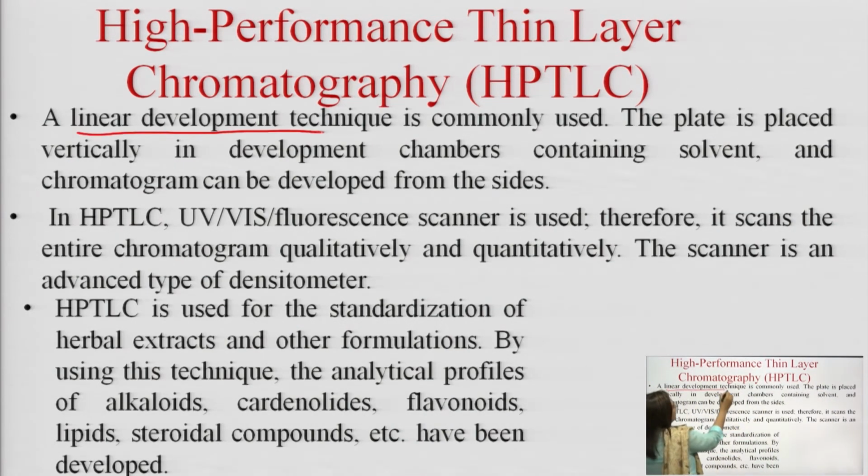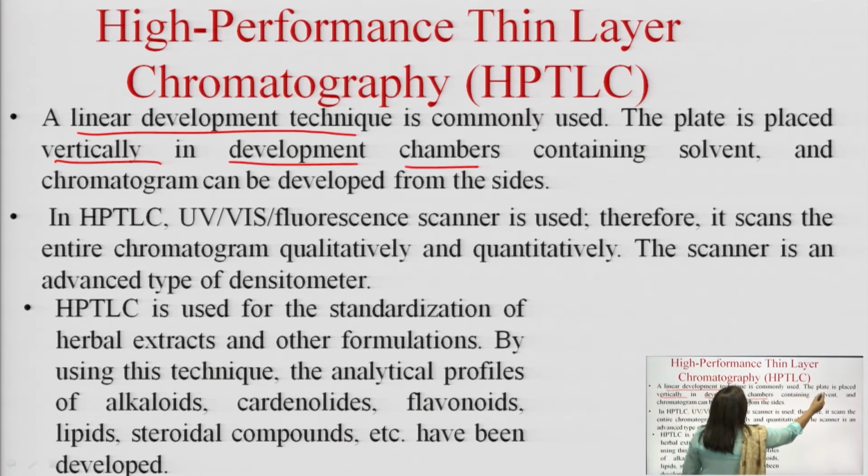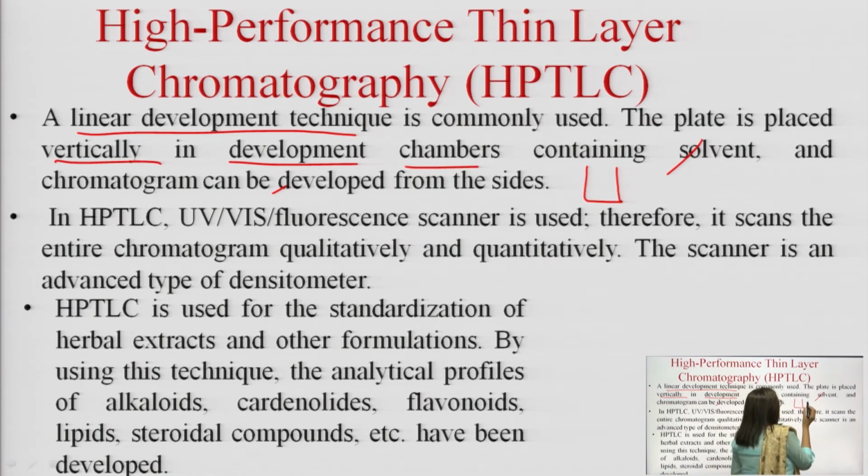A linear development technique is commonly utilized. The plate is placed vertically in the development chambers containing the solvent, and the chromatogram can be developed from the sides, giving you insight in the various types of developmental chambers available for HPTLC. Here some double troughed or S-shaped chambers are available, which are very thin and do not allow much space, making more uniform development of the chromatogram.